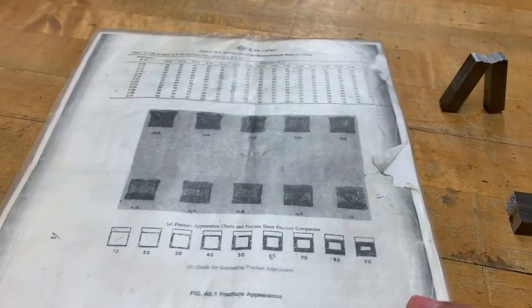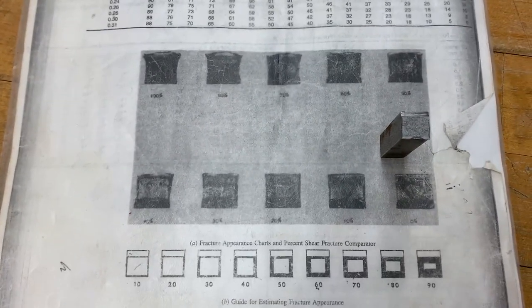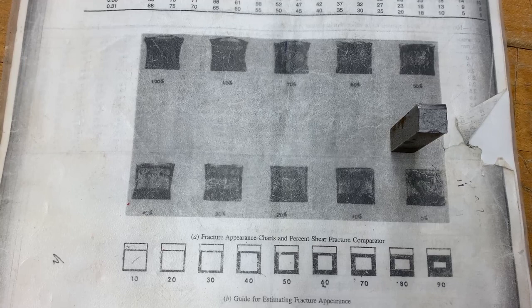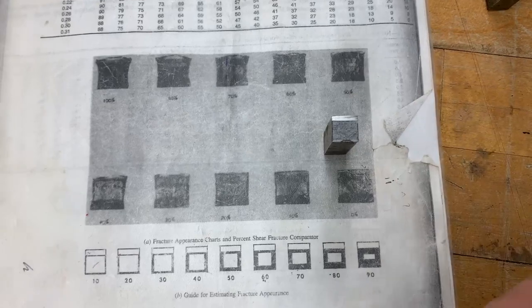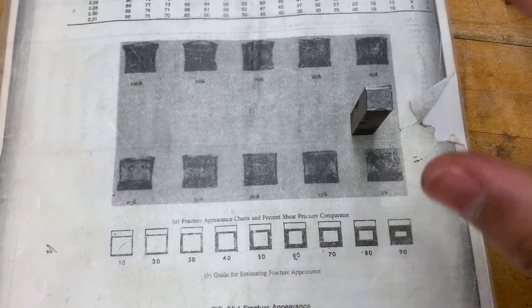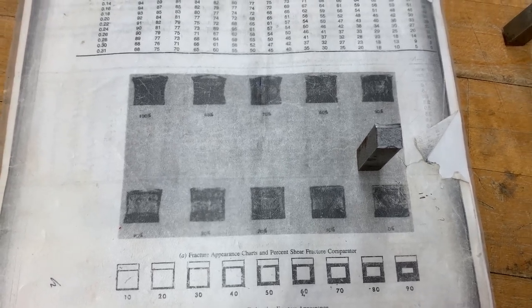We can also do the visual fracture appearance test over here. We look at the sample and try to determine — based on these reference images — the percent ductile versus percent brittle, ranging from 100% ductile to 100% brittle. This one was done at room temperature. We're still waiting for the cold ones for comparison. You just look at the image and determine the classification based on the fracture surface appearance. Then we'll get the cold ones, and later you can do a hot one.